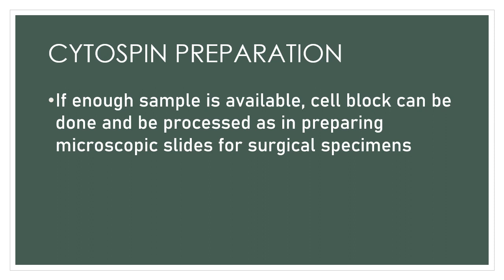The protocol in the hospital where I had my internship is this: you have two test tubes, and you place equal amounts of 95% ethanol in both test tubes.